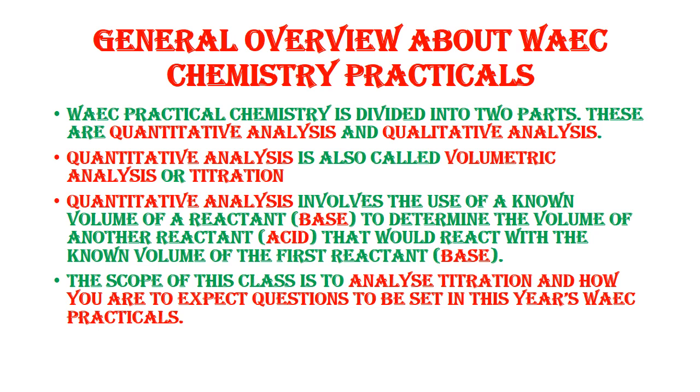Waec practical chemistry is divided into two parts generally. We have the quantitative analysis, and then we have the qualitative analysis. The quantitative analysis is also called titration, or volumetric analysis, where you find the volume of a particular reactant that will be required to react with a fixed or known volume of the other reactant. Are you getting it? And the qualitative analysis is the identification of ions.